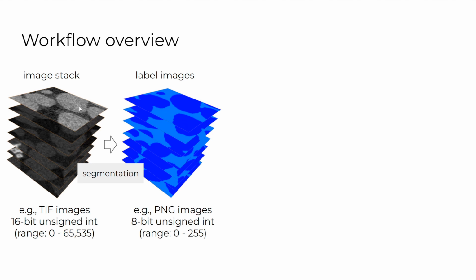So in our sand example here, the result of segmentation will be the label images here, where the two segmented materials, air and sand, have been color-coded. Label images are usually encoded using 8 or 16-bit unsigned integers, where non-zero values correspond to materials, and 0 corresponds to unassigned pixels. So here, for instance, a label of 1 can correspond to air, and 2 can correspond to sand.